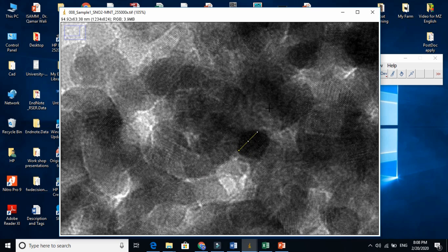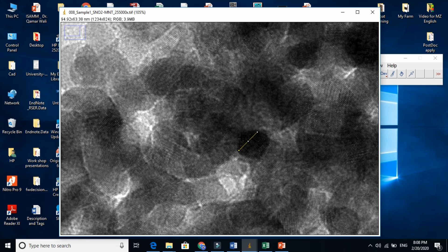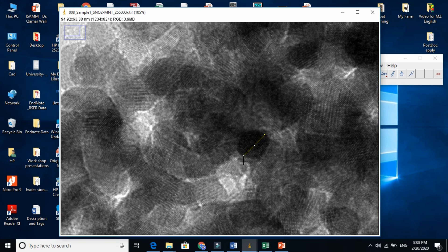This is one side. Now, try to find this way here also, and press control M. And try to find this way also. Press control M. And try to find this way. This is one way to do.